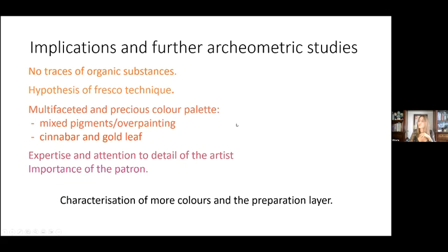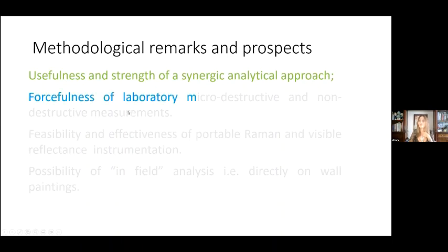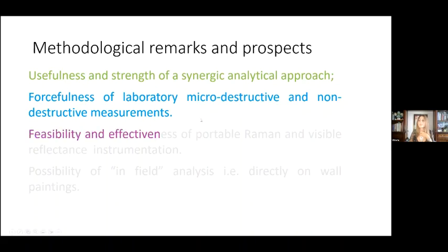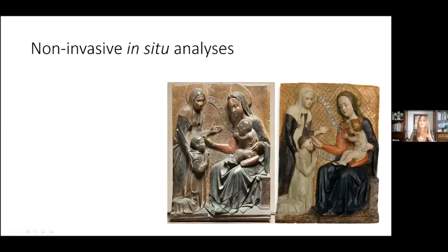Then, from our methodological point of view, the remarks were the usefulness and strength of a synergic analytical approach, the forcefulness of laboratory microdestructive and non-destructive measurements, the feasibility and effectiveness of portable Raman and visible reflectance instrumentation, and the possibility of an in-field analysis, i.e. directly on wall paintings. Let's move to the next case, that is an in-situ campaign.